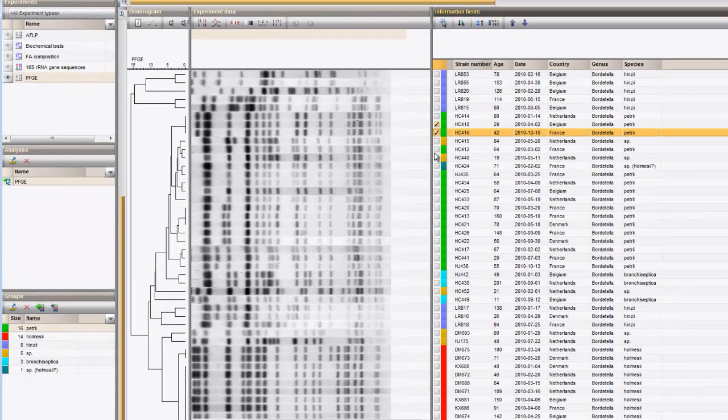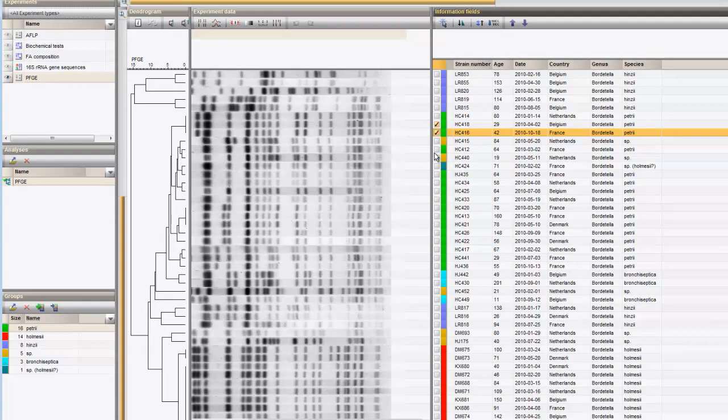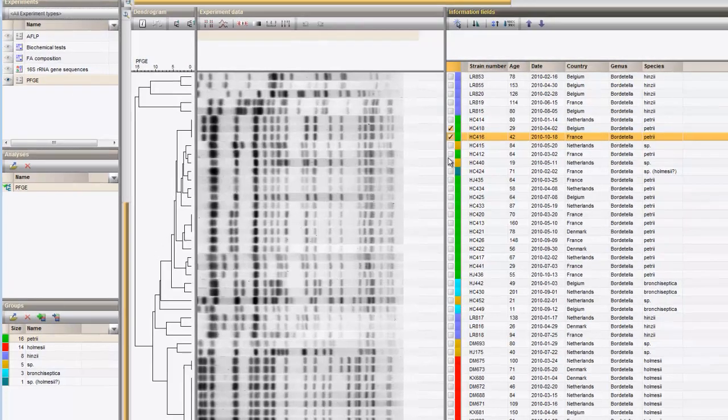To view what is going on between these patterns and to correct any wrong band assignment, the software provides a convenient band editing mode within the comparison window. To activate the band editing mode, I will switch to the band matching view by pressing the button to perform a band matching.